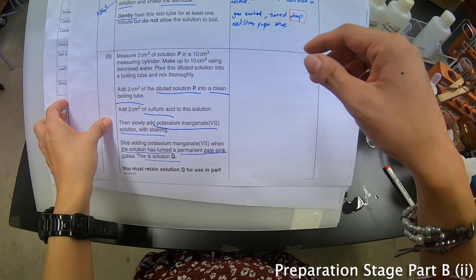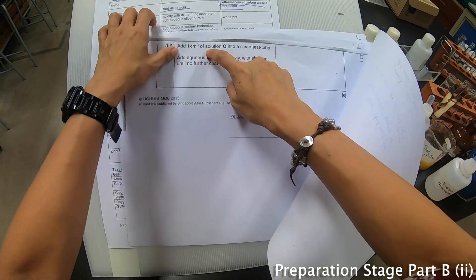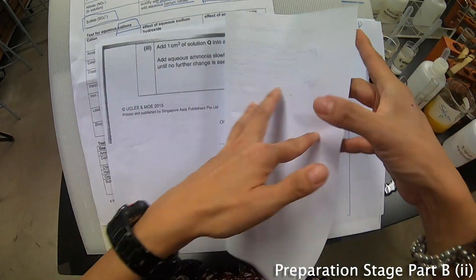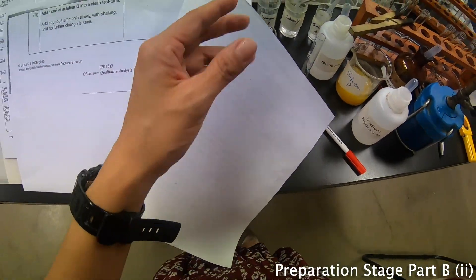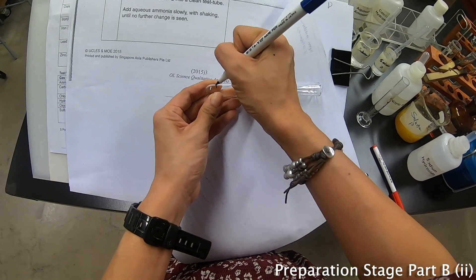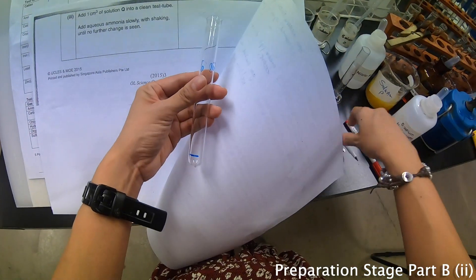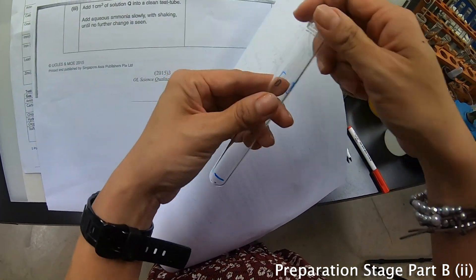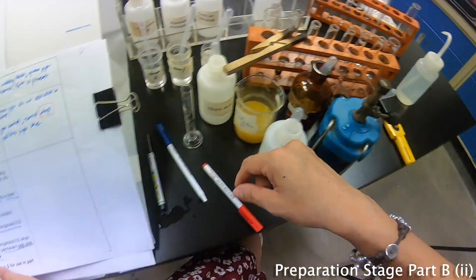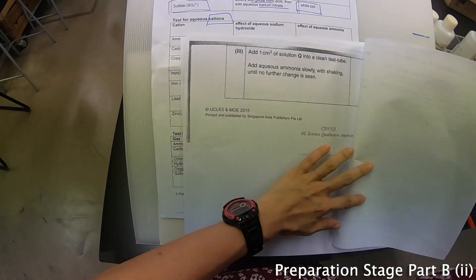The second part says: add about 1 cm³ of Q into a clean test tube. So I take out a test tube with 1 cm³ of Q — I'll call this Part B. Then this part says to add aqueous ammonia. Adding aqueous ammonia is actually a test for cations.